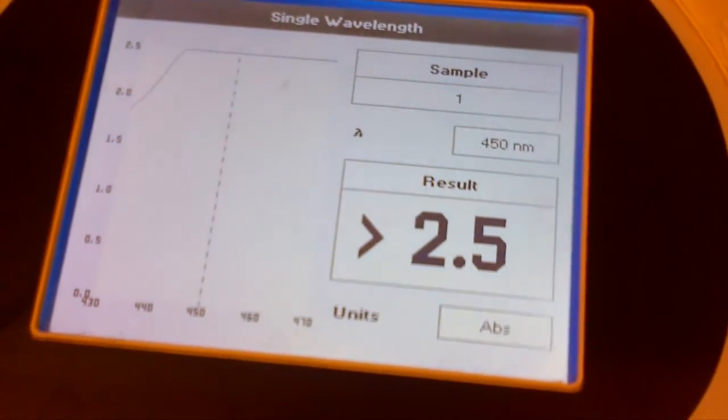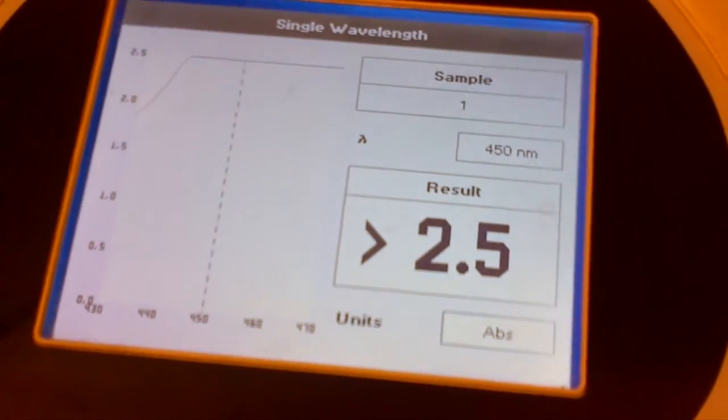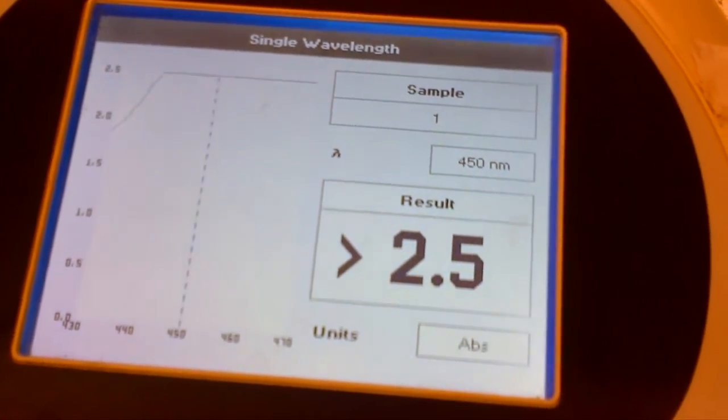So you can now record that value. This is above 2.5. You will obviously in your practical be given a concentration of solution to make up.